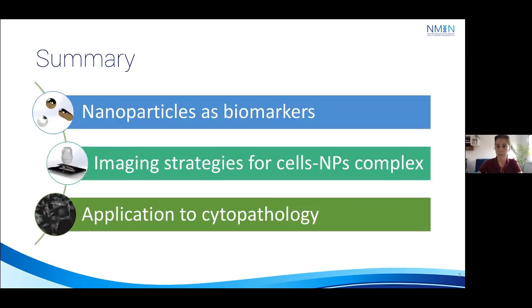Now that we have a bit of context, I'm going to explain better what these plasmonic nanoparticles are that we want to use and the various strategies for their visualization, after which I'll present a proof of concept for our technology on cells.